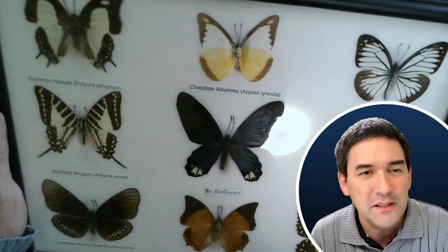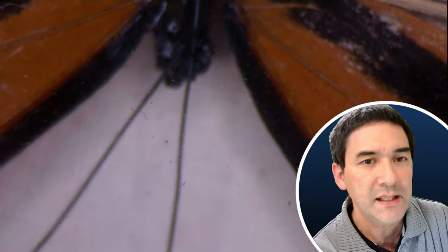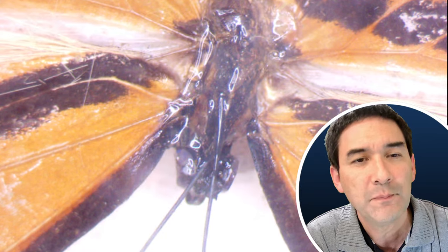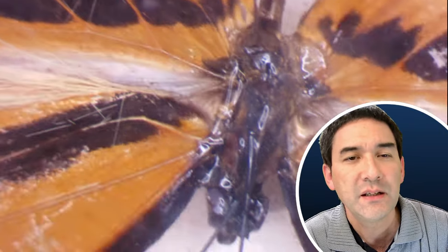Please do ask questions, but at the end of this section I'll go back to questions and try to answer them. I'm going to switch over to my stereo microscope now. I'll be looking at a few specimens and making a couple of pictures. The only issue is that I'm looking through glass — this affects focus and I'll need to zoom out a little bit.